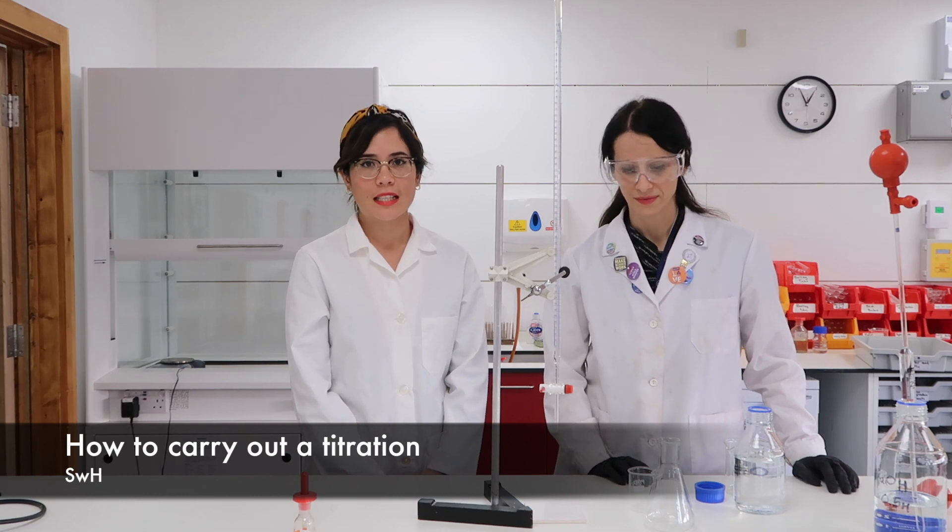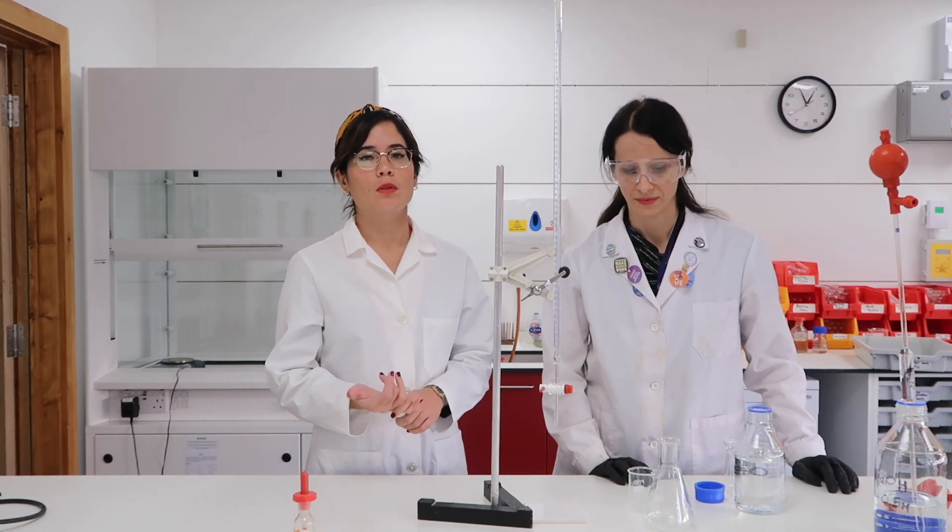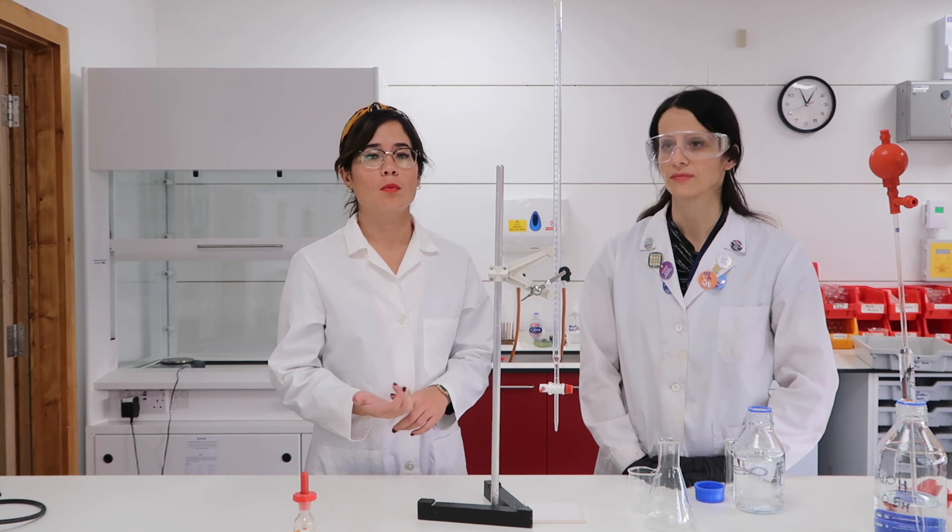You should absolutely follow that. In this video, Emilia and I are going to show you how to carry out a titration. There are lots of different reasons why you carry out a titration. One could be that you want to produce a soluble salt which contains ammonium, potassium or sodium. Because of the way in which these soluble salts dissolve, you need to use a titration in order to work out very accurate volumes of both reactants.